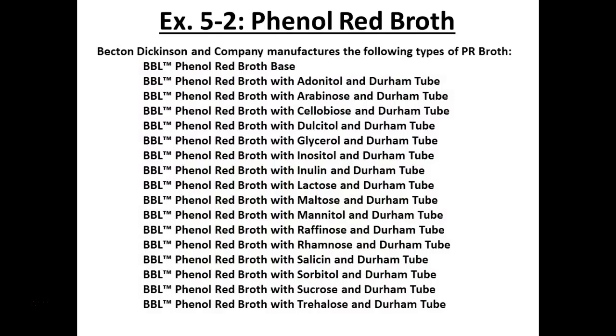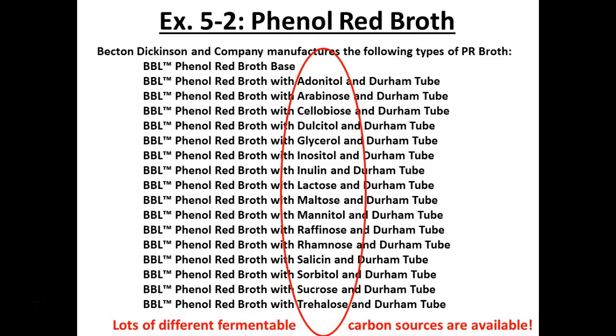There are lots of different sugars that you could test for, right? So notice this huge list of sugar and sugar derivatives. Anyone know which sugar we're testing for the ability to break down? Lactose? Nope. Glucose. Lactose, sometimes, some labs do that. But we do glucose.